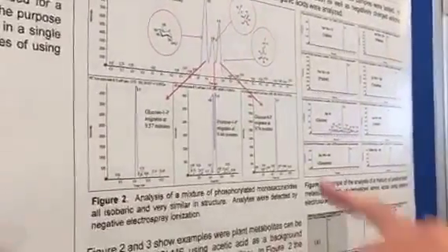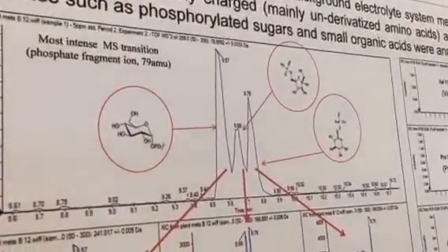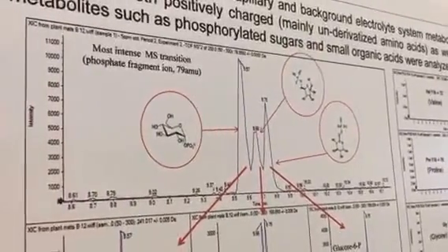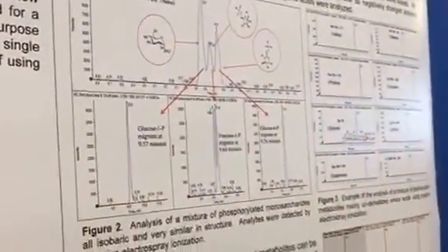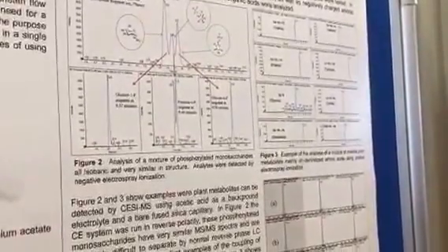Here on CESI you can see that we actually get separation, which is based partially on the pI, the isoelectric point of these molecules, and also on their shape. So this then gives us a better chance for the analysis and characterization by mass spectrometry, because these peaks can be analyzed individually with minimal overlap of the charge envelopes.